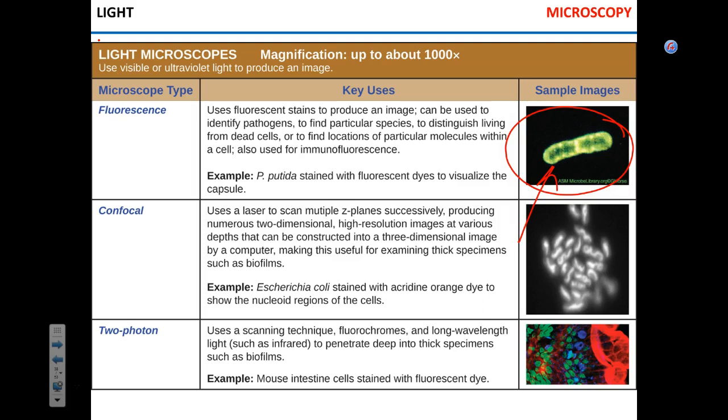Does that make sense? Then you wash, do all these technical steps, and then you put your microscopic specimen, the object that you control, under the fluorescent microscope. And if there are any mycoplasma cells, they will start to light up green. And you can say if your culture is contaminated. Okay.